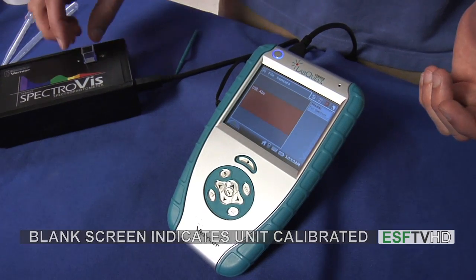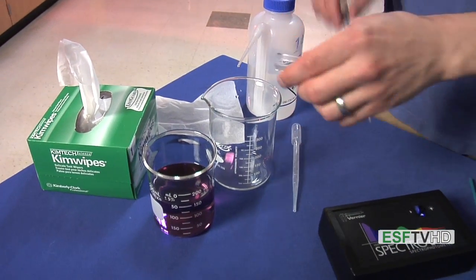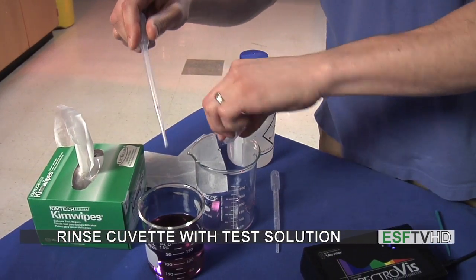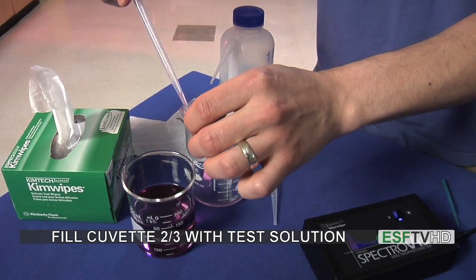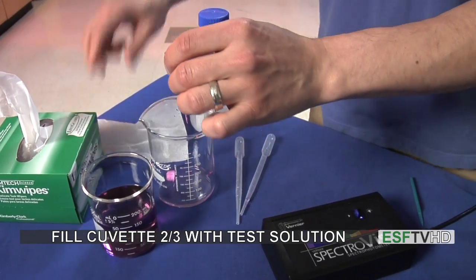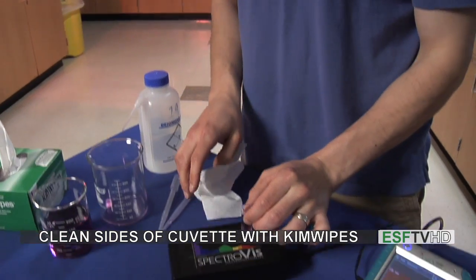I'm now going to take my cuvette out and trade it for my solution that I'm going to test. I'm going to pour my solution into my waste beaker and fill it with my test solution. I'm going to fill my cuvette once to rinse it, dispense that out, and then fill it again about two-thirds full. I'll clean off the sides of the cuvette again so the windows are clear and clean, and insert it into the spectrometer.